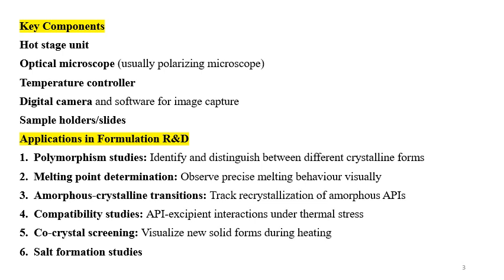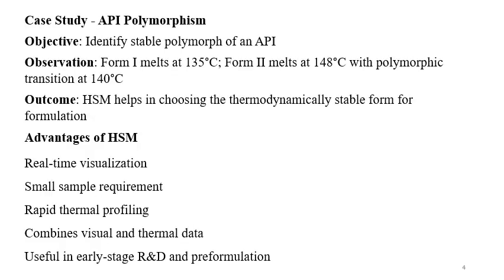Polymorphism studies identify and distinguish between different crystalline forms. Melting point determination: observe precise melting behavior visually. Amorphous crystalline transitions: track recrystallization of amorphous API. Compatibility studies: API excipient interactions under thermal stress. Co-crystal screening: visualize new solid forms during heating, and salt formation studies. So based on the requirement, based on the study objective, the HSM technique can be used.